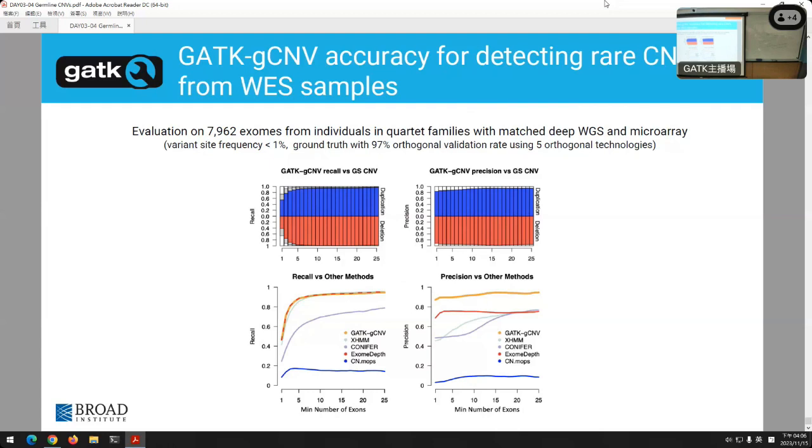So taking in read count over a set of intervals and then performing PCA and then clustering. That will identify groups of samples that are well-matched. So really the sequencing method and the capture and things like that are what's going to influence how well matched the samples are, rather than family structure.